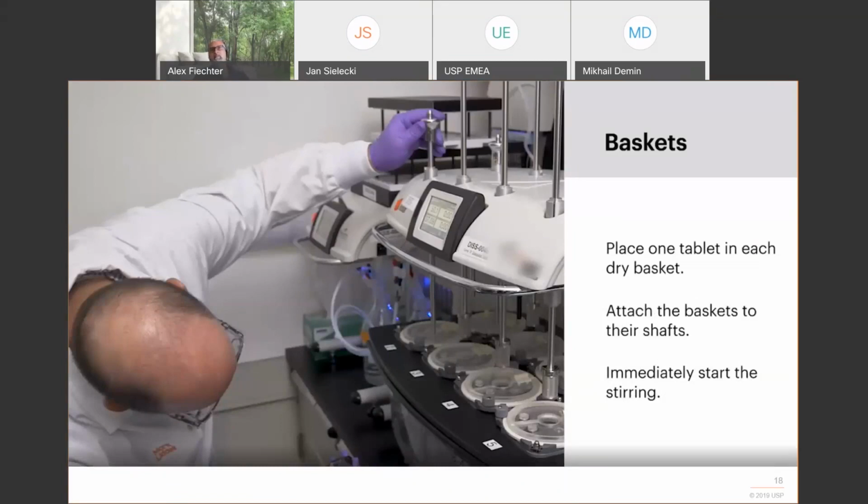The longer you expose the tablet when you take it out of a blister, to environment, humid conditions, or even to a wet basket, the more different your results are going to be. So again, for the sake of reproducibility, make sure that your baskets are all dry and you put the tablet into a dry basket before you immerse it into the vessels.